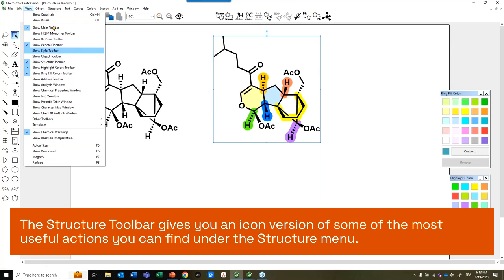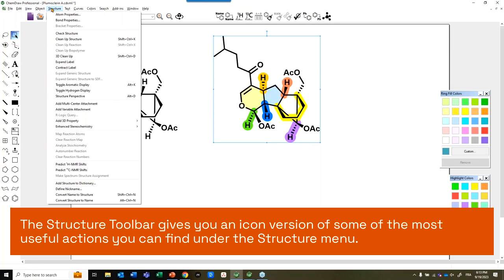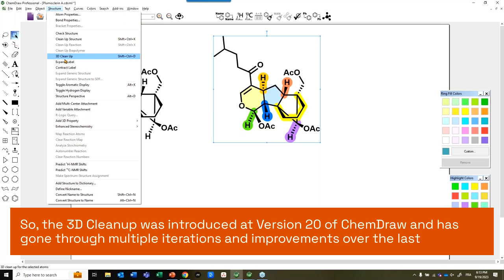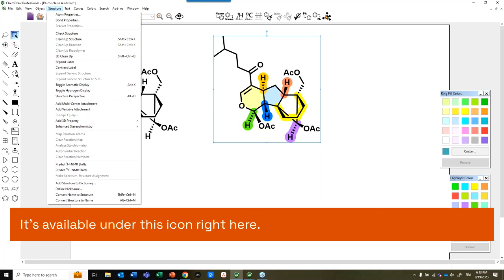The Structure Toolbar gives you an icon version of some of the most useful actions you can find under the Structure menu. One of them is the 3D cleanup. So the 3D cleanup was introduced at version 20 of ChemDraw and has gone through multiple iterations and improvements over the last versions.